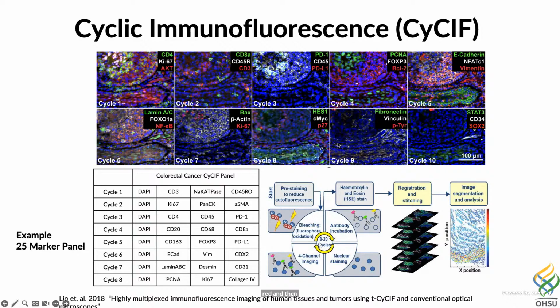The most common analysis that you do after you've done the imaging is to segment each cell and then use the cell boundary for each individual cell to measure the average pixel value for every marker channel in your image. That gives you a mean intensity value for every marker for every cell. You can gate that value, and that will give you a classification of a positive or negative cell for that marker. That's how we can do cell phenotyping within a spatial resolution.